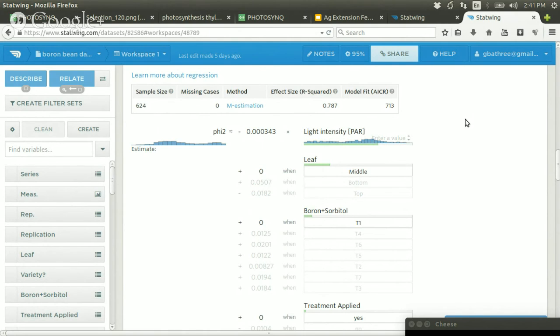In order to be able to do that, we need enough data so that when they say, I am growing corn, it's week 6, there's been no rain in the last week, and it's this variety and this location, right? If they can say those things and we have sufficient data to match existing known populations with known outcomes to their specific case, then we can build an algorithm to tell them, hey, given all these other guys who are similar to you, you have very low chlorophyll content, or very high chlorophyll content, or this looks healthy or not healthy.